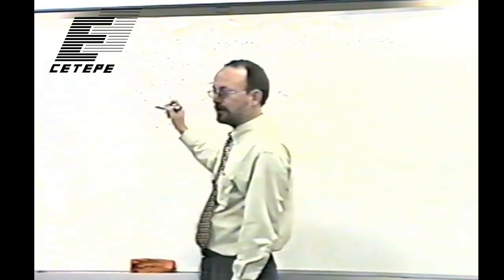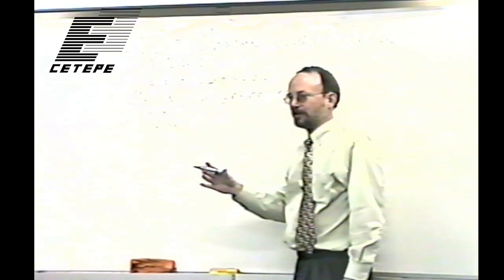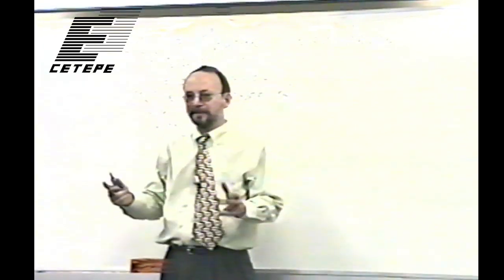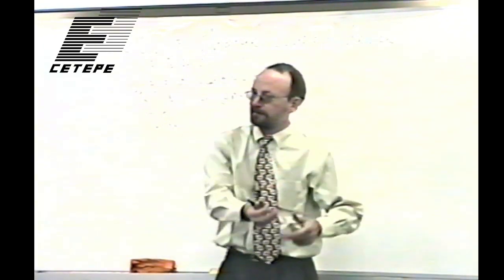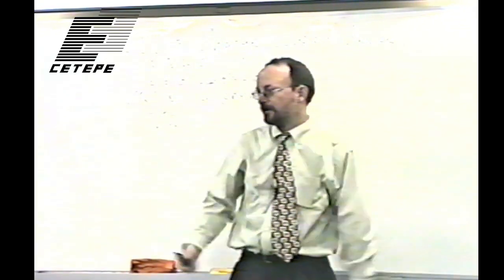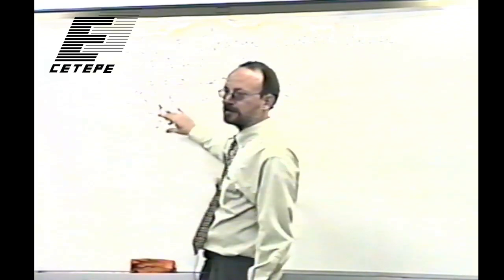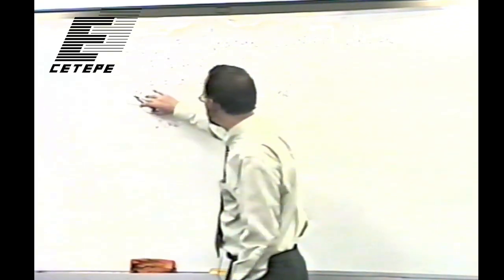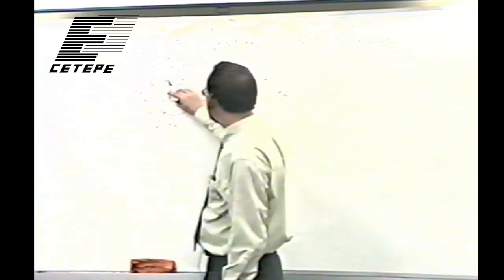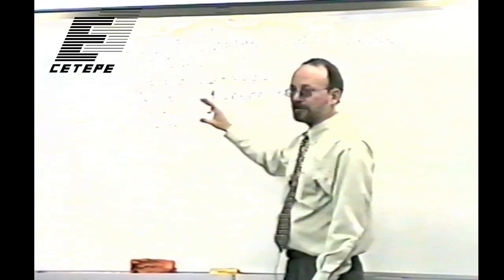Okay? And what happens then is a bucket brigade. I don't know how you would say bucket brigade in Portuguese. But in the old days when they used to put out a fire, they would take buckets and pass them down a line of men, or women, I guess, to put out the fire. And so we call this clocking out the electrons in a bucket brigade fashion, because you take the electrons that were here and you shift them under here, and then you shift them under here. And then you continue to shift them so that you're able to read the image out.